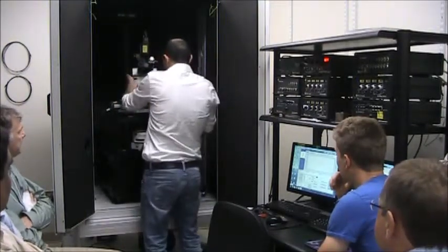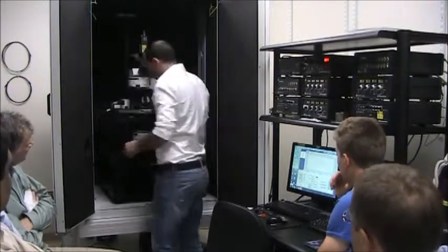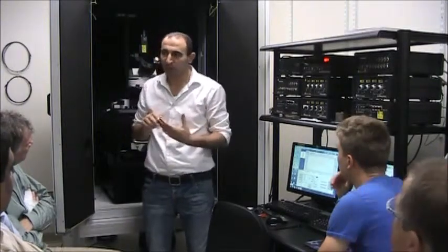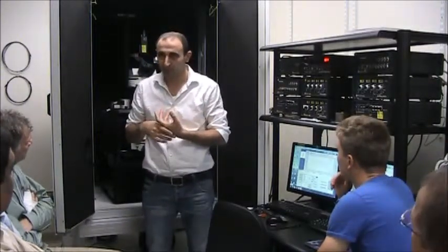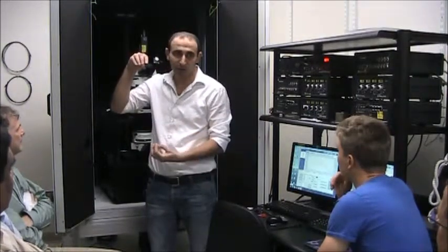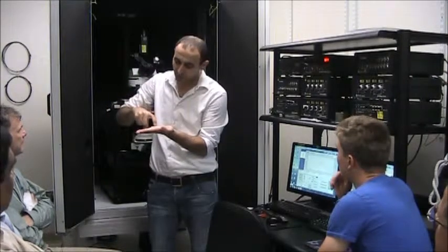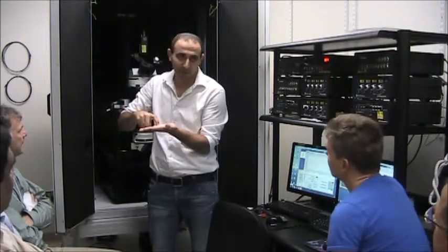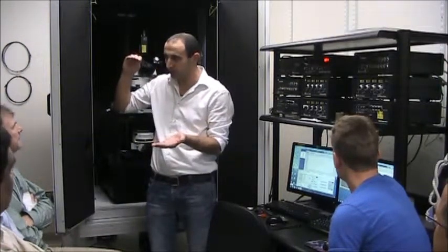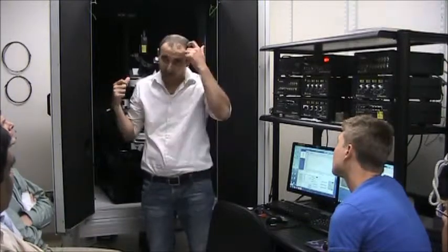So before starting the approach, let's see some optics here. As I said initially, this system was designed to be integrated with optics. So we have a clear optical axis from top and from bottom, where one can see the exact contact point of the tip with the sample. This is due to the flat scanning stages from top and bottom for the sample stages and the tip stages, and also for the probes themselves. So we will soon see the tip itself.